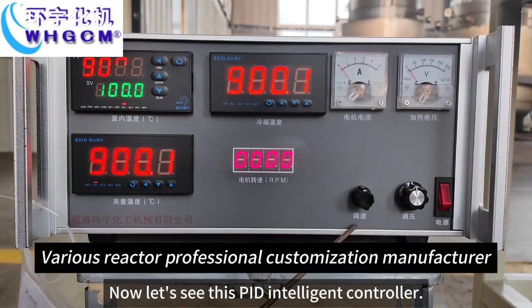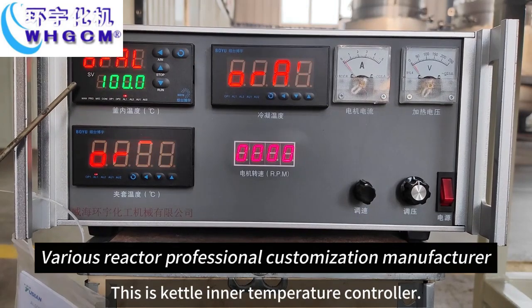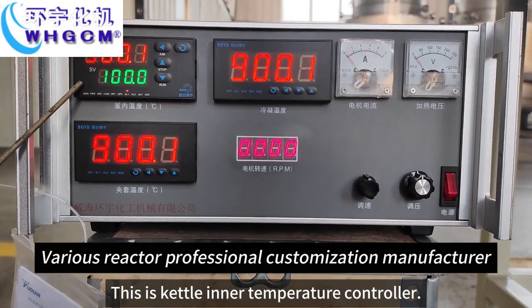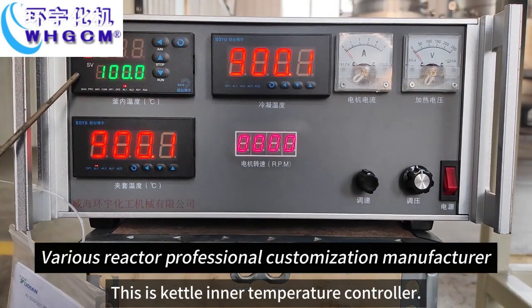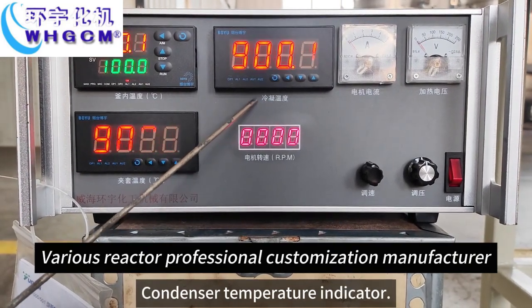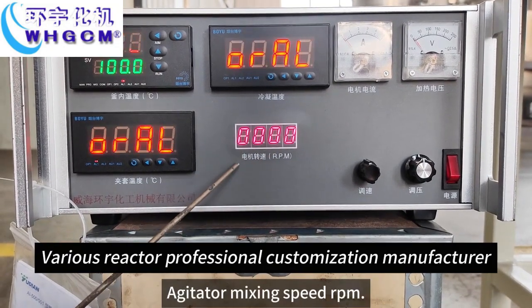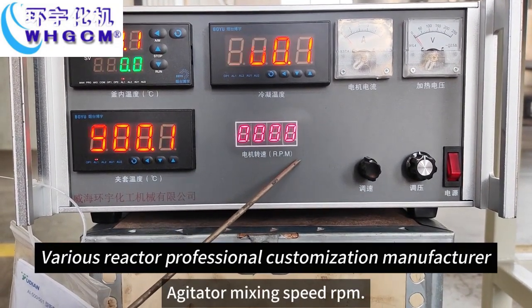Now let's see this PID intelligent controller. This is the kettle inner temperature controller, jacket temperature controller, condenser temperature indicator, agitator mixing speed RPM.